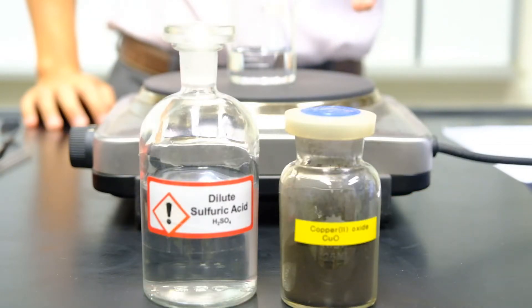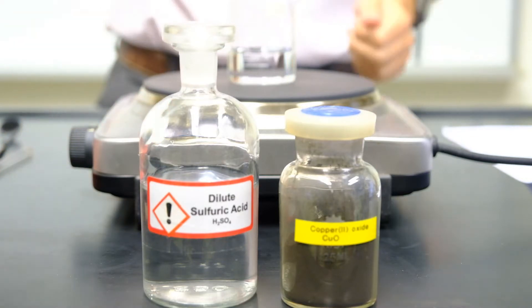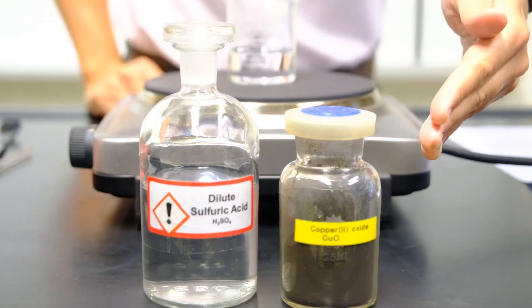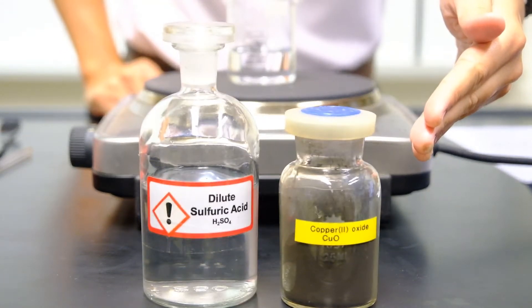On this hot plate, you'll see a beaker consisting of sulfuric acid. In this bottle, there's a black solid copper-2-oxide, an insoluble base.